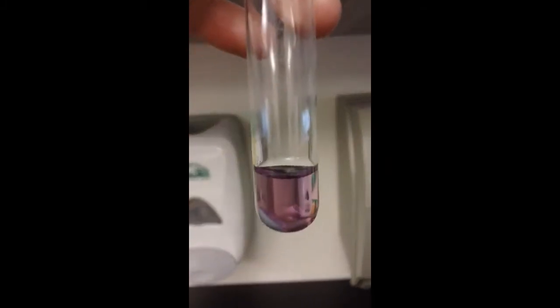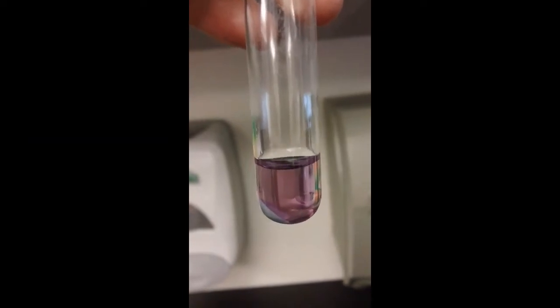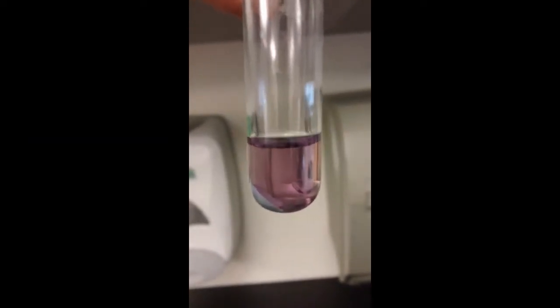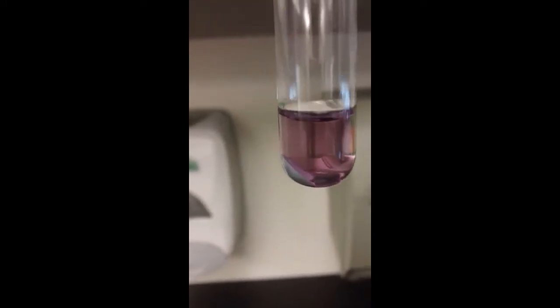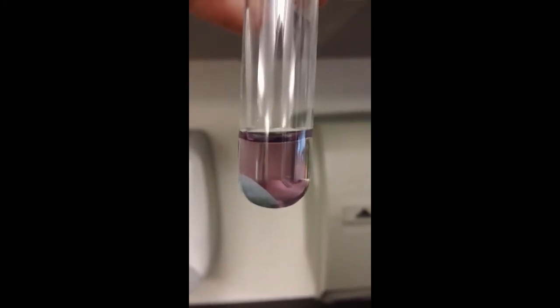Notice how right there, record the results. Notice the solid. Also note the color and about how much. As many observations as you can. One word is never okay.